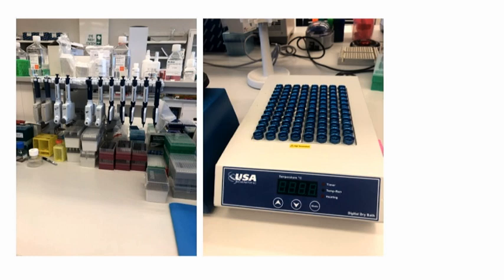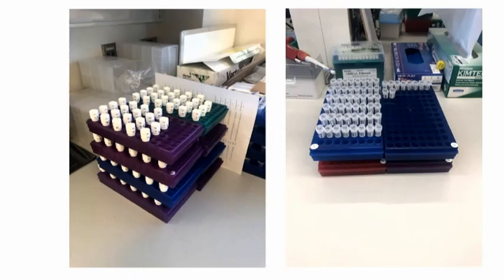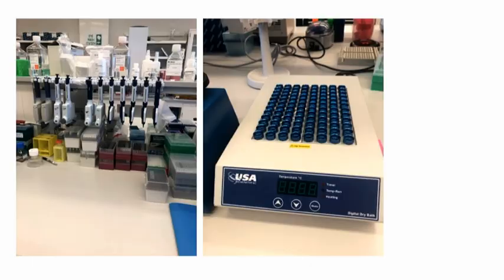equipment, both a heat block that holds those tubes quite specifically, as you see here. You need a centrifuge that holds the tubes as well, so you can spin down that tissue pellet that's mentioned in the protocol. And then we use an absolute ton of multi-channel pipettors, especially the expandable ones, which you see here, to make some of the liquid handling steps a lot more convenient. In these racks, the expandable pipettes can reach across this direction, so it works out all right.